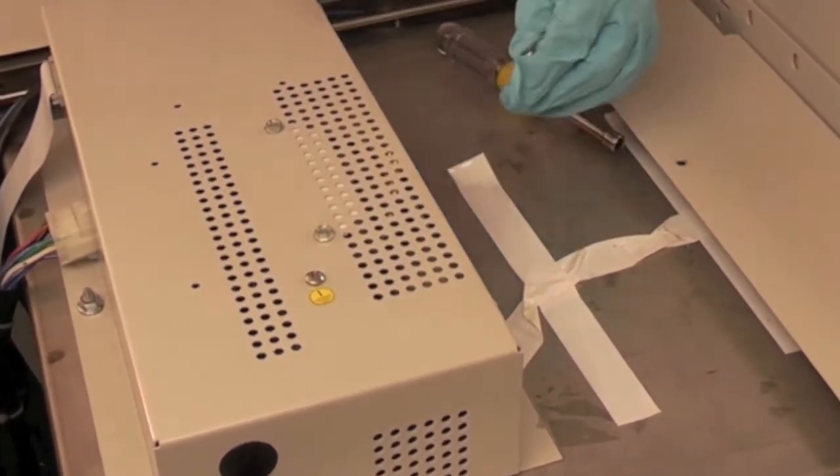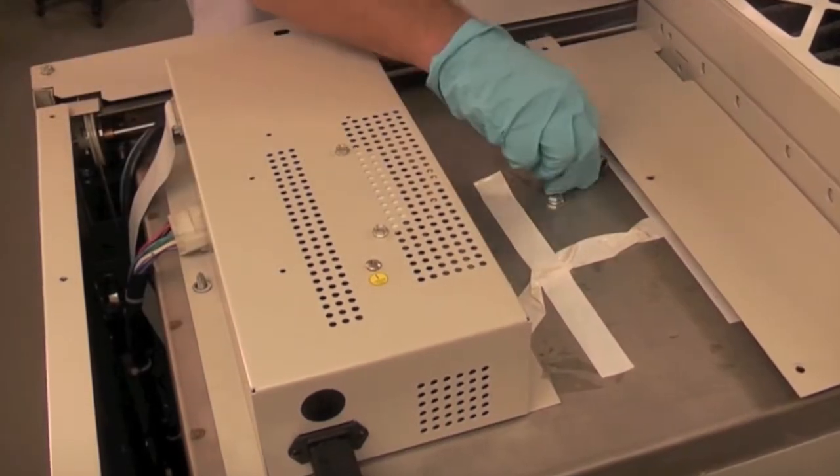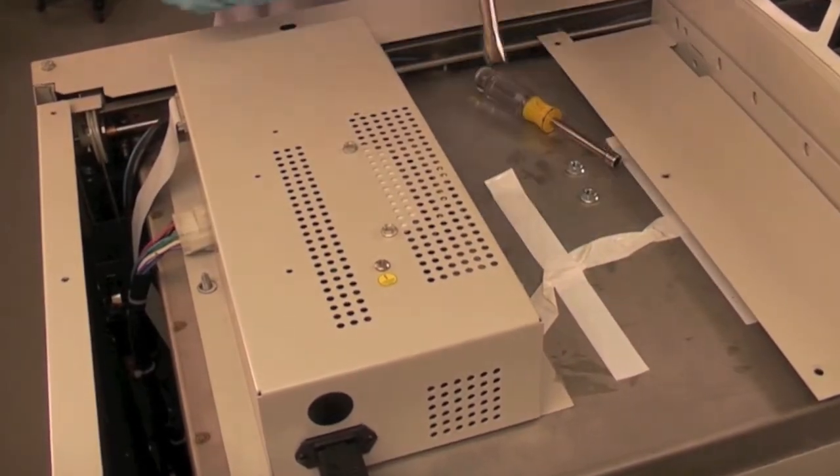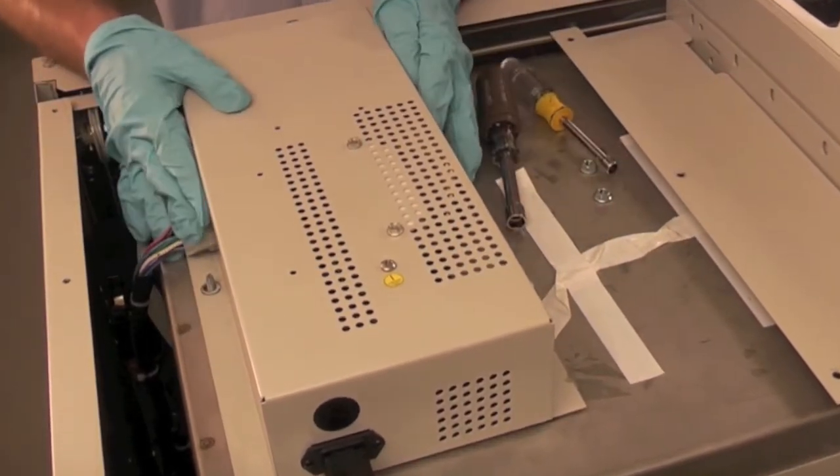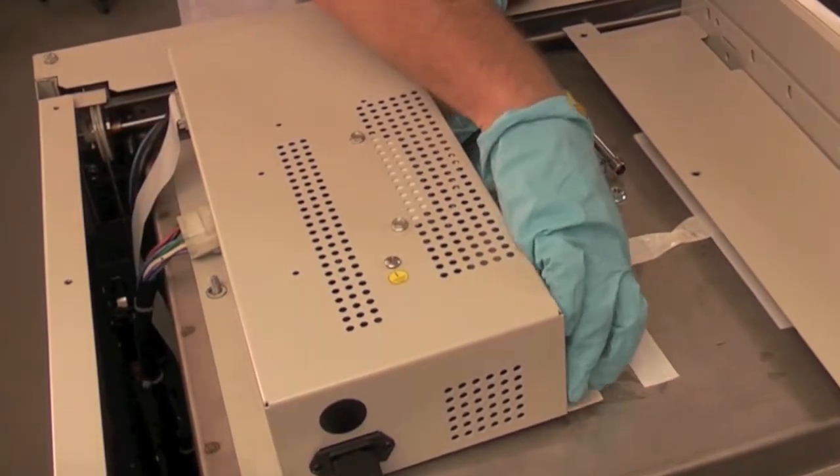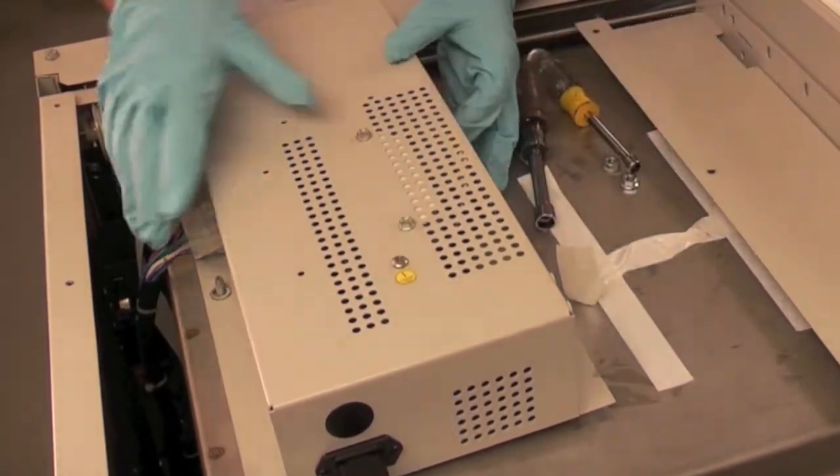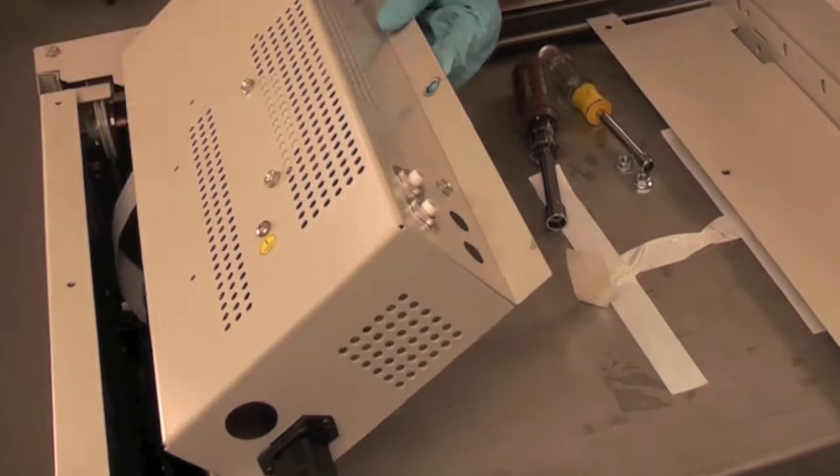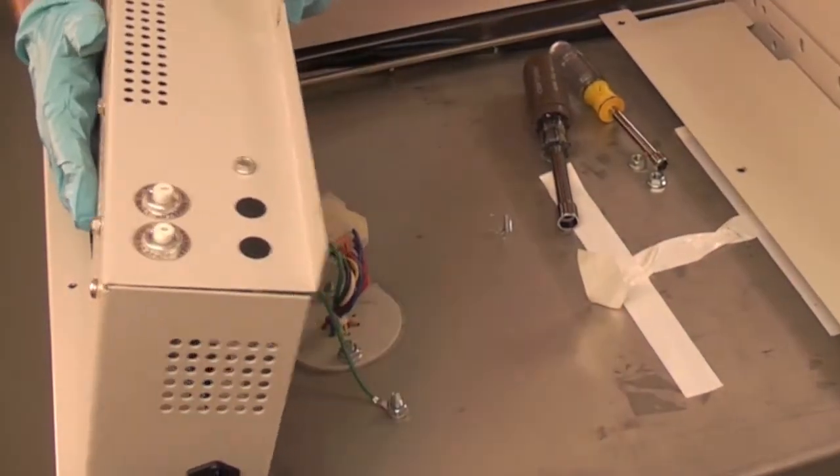Tilt the electronics module on its side to access the underside of the module. Secure the module so that it does not fall and damage the wiring. Locate the fluorescent lamp ballast in the module.